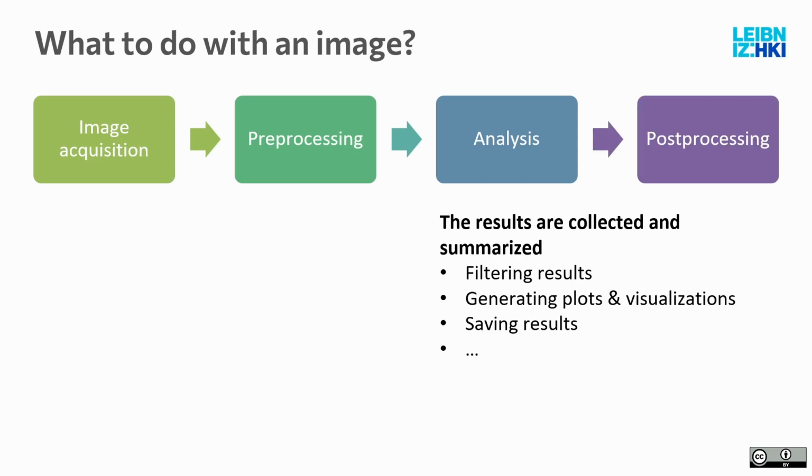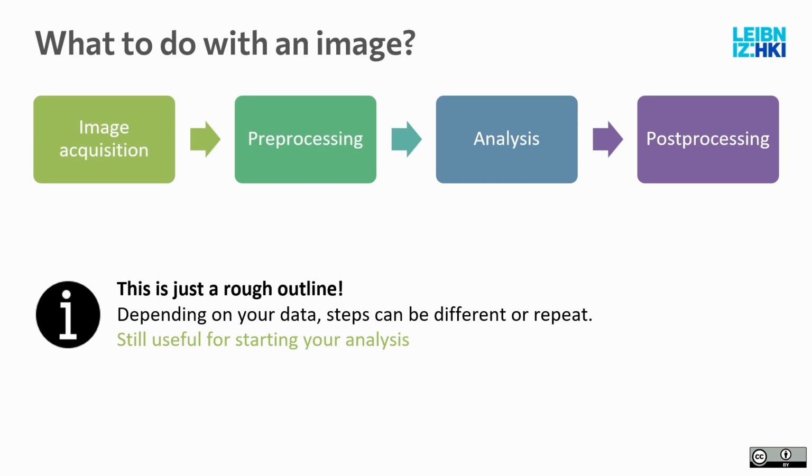And then later on, you do some post-processing. You would collect the results from the analysis and then, for example, filter them. For example, you detected some debris, filter those out. Generate plots, generate statistics, saving everything out. So you have it as an Excel file, as visualizations that you can upload somewhere or use later on, and many more. And these are basically the basic steps of image analysis that are usually never working out.